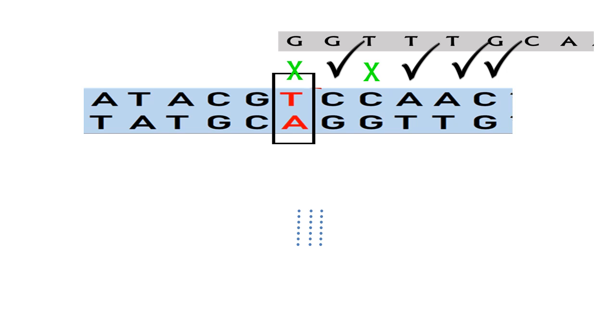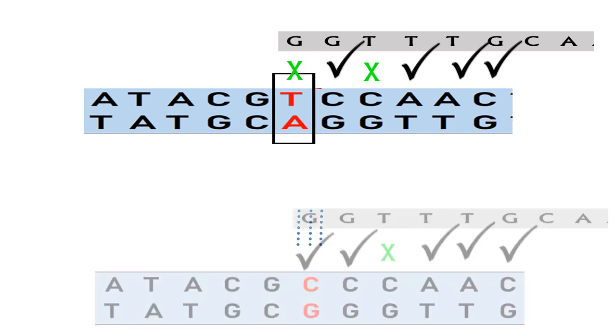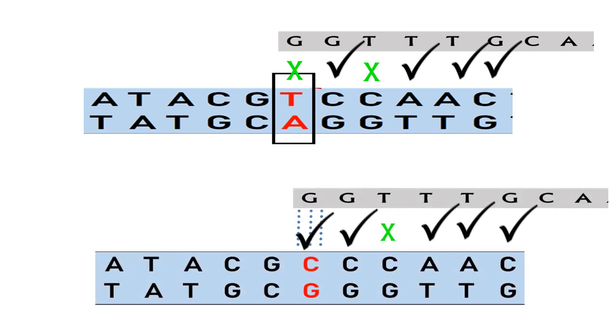When these two mismatches are present in the primer, then there is no amplification at all. In a second scenario, we can see that there is a mismatch, but it will not hinder the attachment because the end is getting attached.